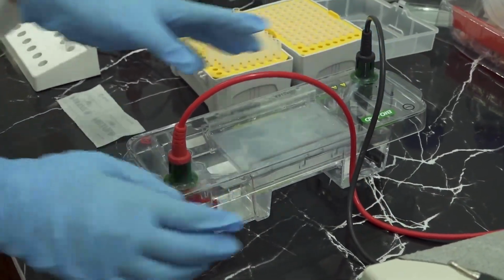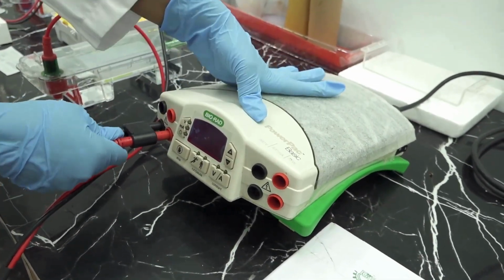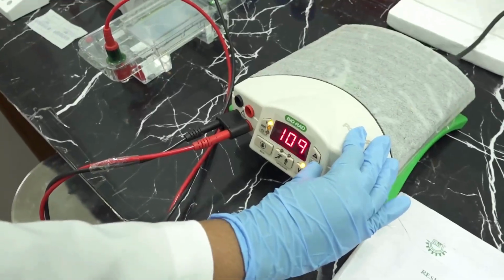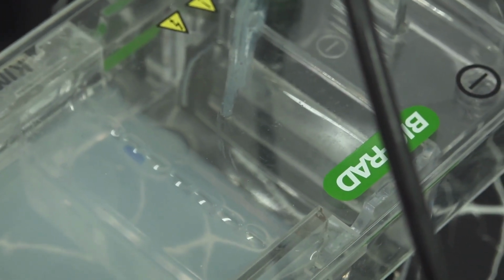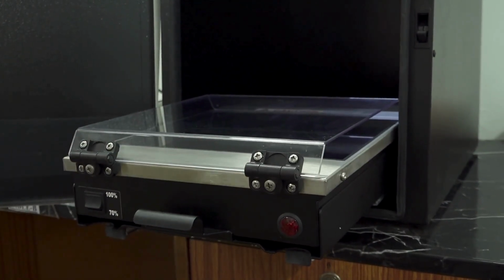Put the electrode lid on correctly, red to red and black to black. Run the gel at 80 to 150 volts until the dye line is approximately 75 to 80% of the way down the gel.